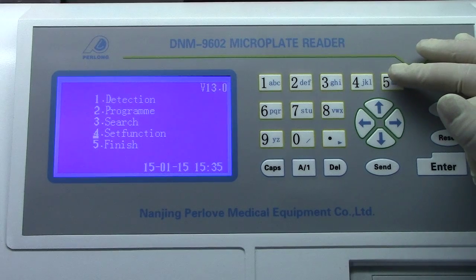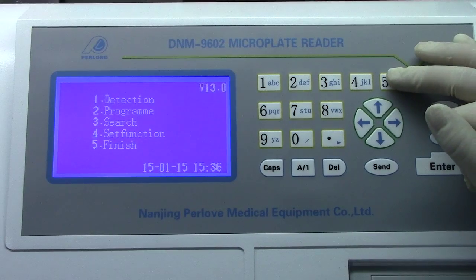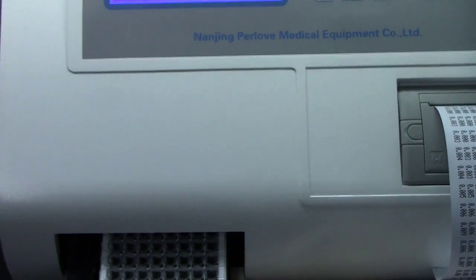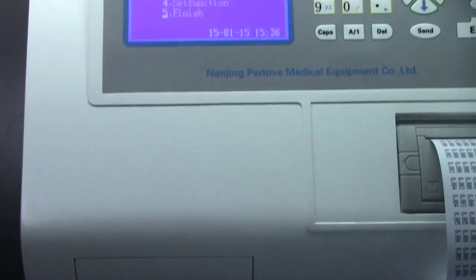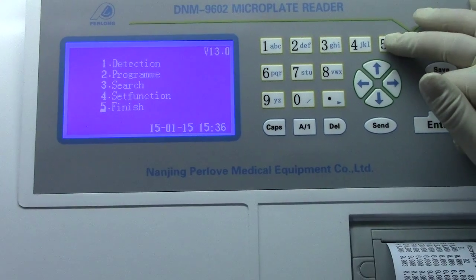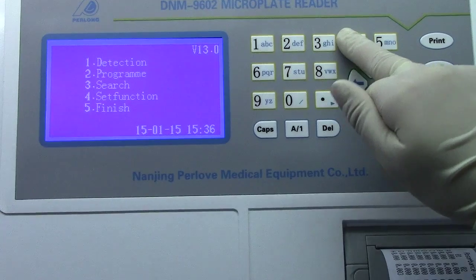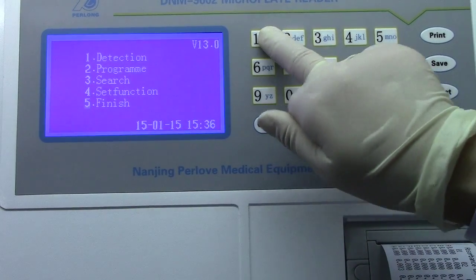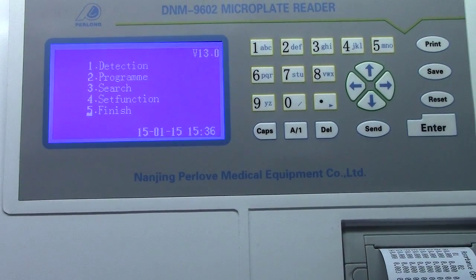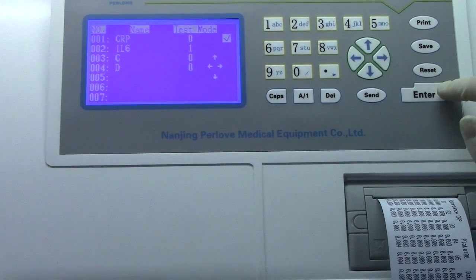If we don't use this device, we can press 5 — finish — to retract the microplate inside the device, to avoid dust or other things affecting the machine's quality. Once we press finish, the other functions are invalid, just like this. If we want to use the device again, press 5 again. The holder will come out, and the functions will work again.